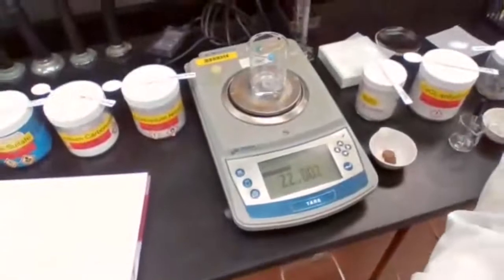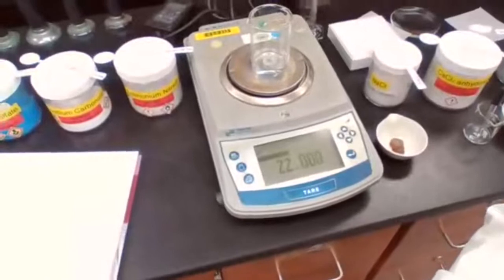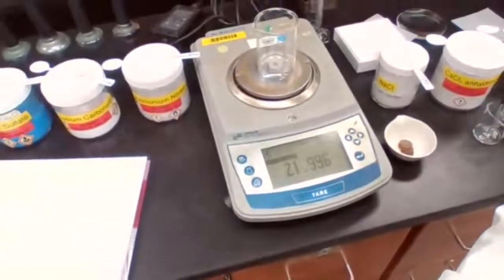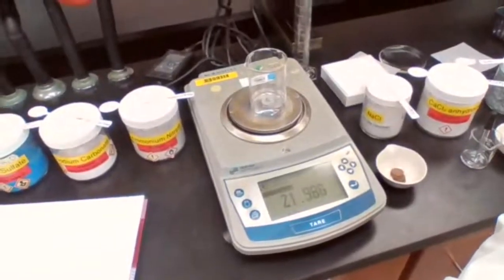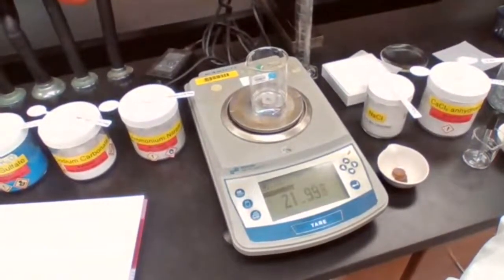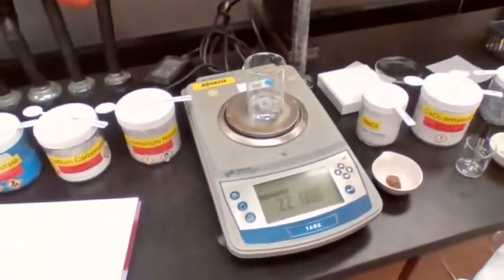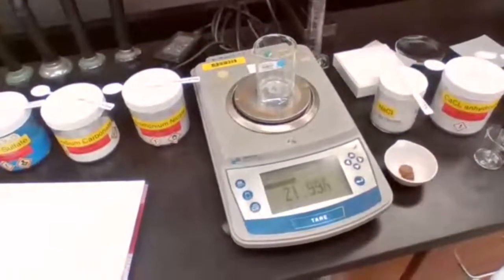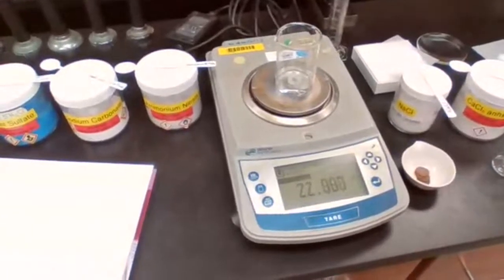Okay, I have 22.00, and the last digit is impossible to fix. So 22.00, take a screenshot of this number here, or record the number. Okay. Good. 22.00. That is the mass of the water.